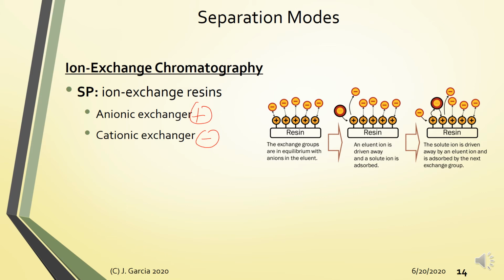Now for resins, the ion exchange resin can be classified either as a strong exchanger or a weak exchanger. Yung mga strong type nito has the functionality of a quaternary ammonium ion, NR3+. Whereas yung weak anionic exchangers would have something like this.